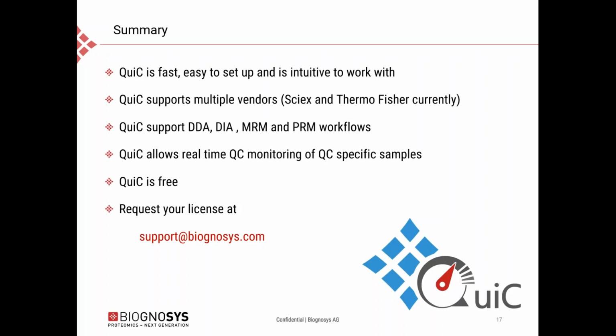The next question: is SPS-MS3 TMT-like data supported, and is it necessary to have the IRT peptides in there? In other words, which features will I lose without it? Okay, so I can take this question. The IRT peptides are needed in general for the QuiC tool because it will not run any analysis if the IRT peptides were not in the sample.